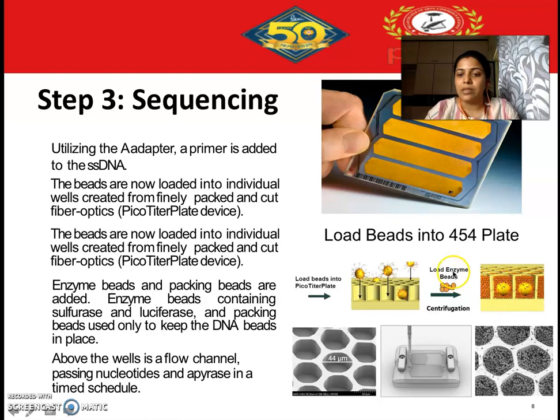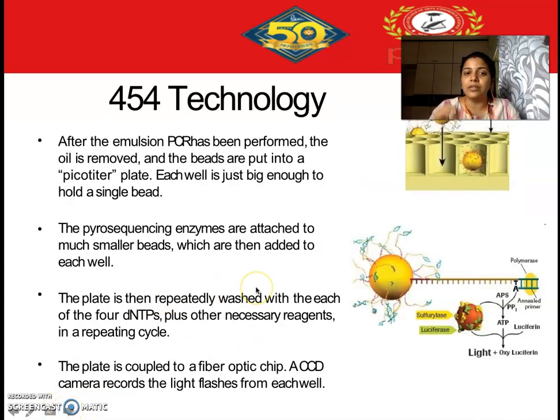You can see the beads which are loaded with enzymes, and there are some packing beads also that will get added. All the enzymes, you have sulfurylase, luciferase, polymerase, everything would be added in this, and also apyrase. The entire well is a kind of flow channel. So the nucleotides and apyrase will be timely scheduled to pass through this entire channel however we want. In the software it can be specified for how much time we want it to be passed.